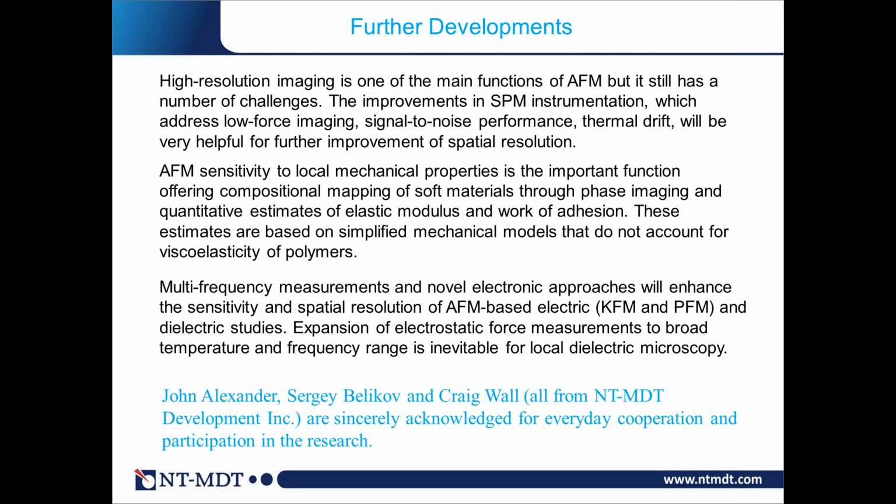If you want to do experiments in an AFM setup, you need to watch that your laser beam is really focused on the same spot of the cantilever when you do tuning, and that the beam is of the same size, and then you can get reproducible data. But generally, that's a challenge, and I don't think for stiff cantilevers we can eliminate that 20% barrier. We cannot eliminate this 20% barrier for the stiff tips, and that's a challenge.